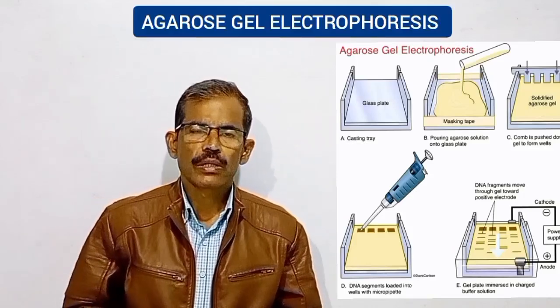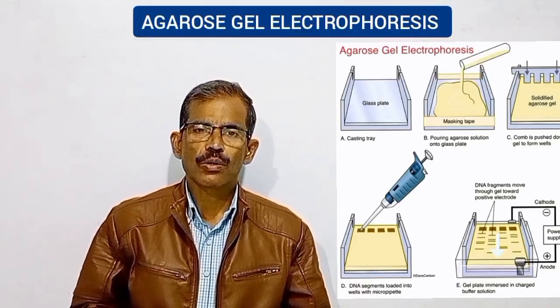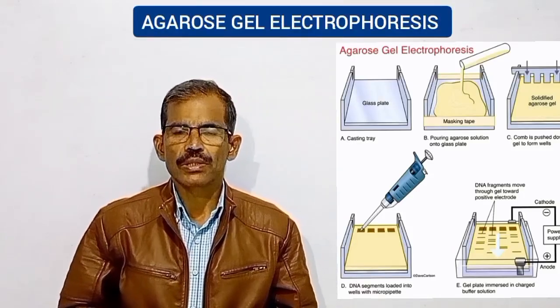Today we shall discuss agarose gel electrophoresis.